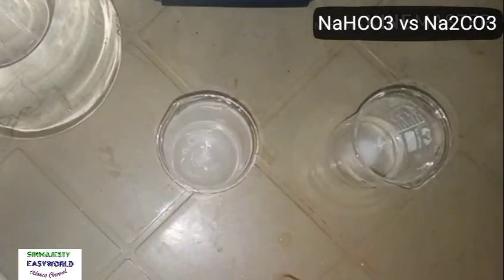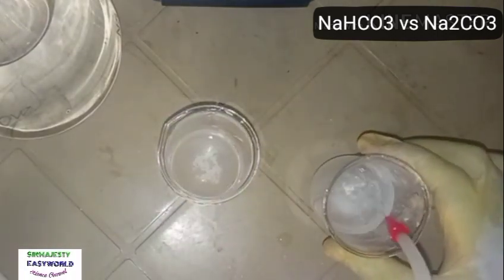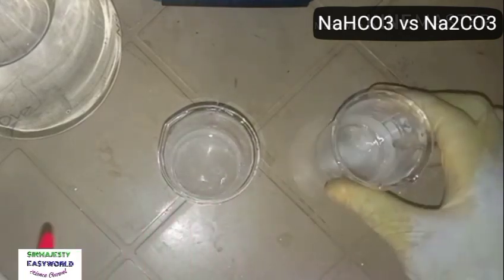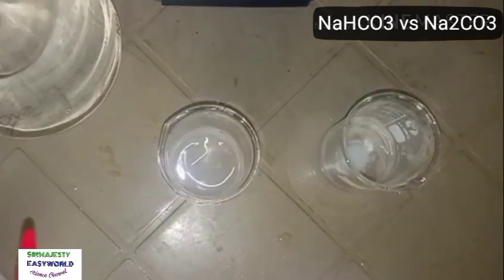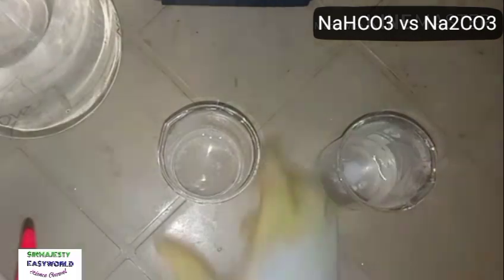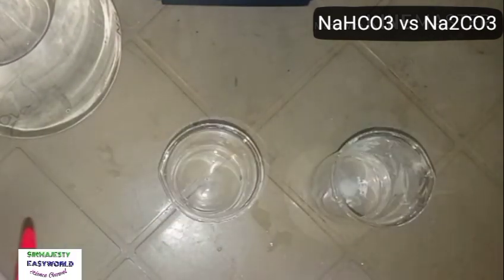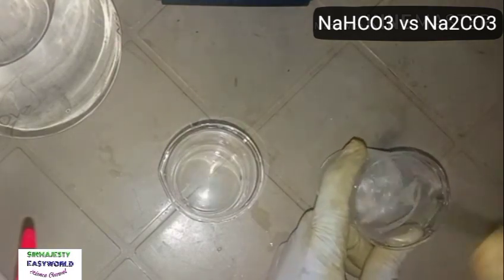Over here, I want to use litmus paper to start with. Remember that litmus base turns red litmus paper blue. So I want to start with the action of litmus on each of them, even though they have not finished dissolving. But the amount we need in moles is there already. Let's be patient a bit. So I'll use a glass rod to stir, to facilitate the dissolution.